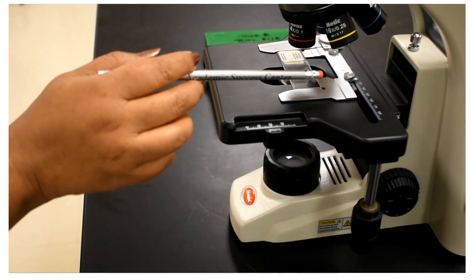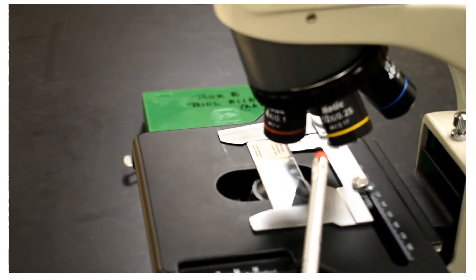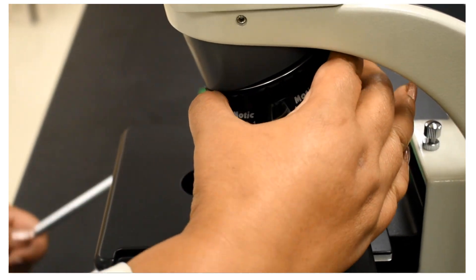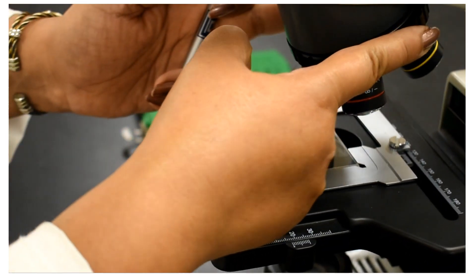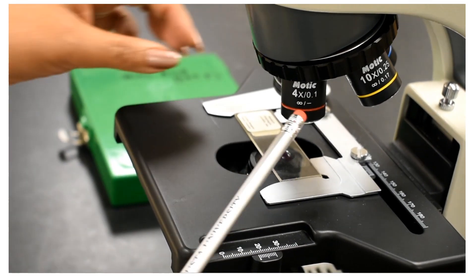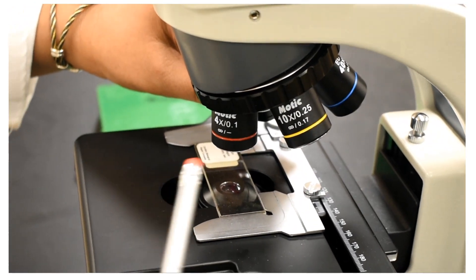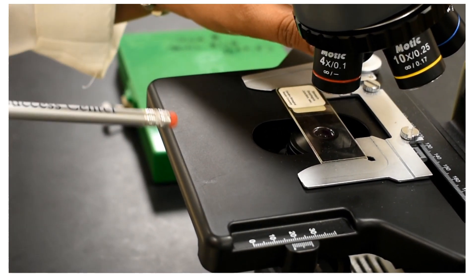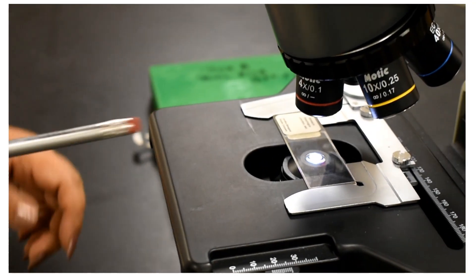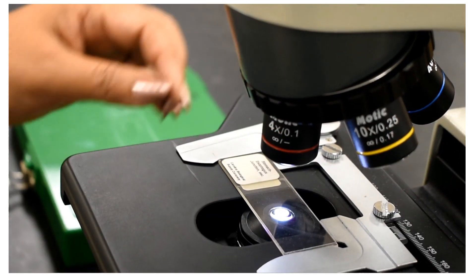Continuing upward, this area is called the rotating nosepiece, from which four objective lenses hang. When we move this part, you can see it rotating — that is why it is called the rotating nosepiece. There are four objective lenses. When we move the rotating nosepiece, we can bring one particular objective lens into position — aligned with the light source coming through the stage. You will hear a clicking noise when the lens is properly in position.